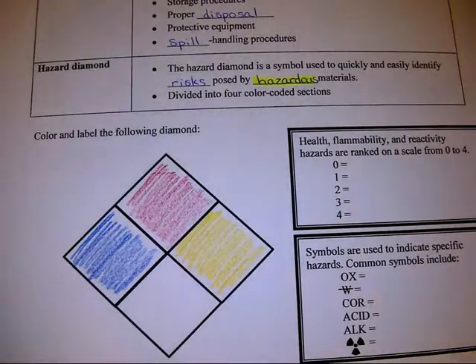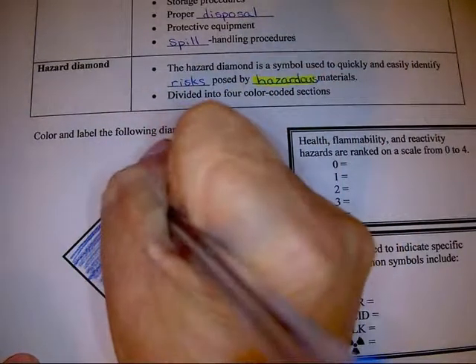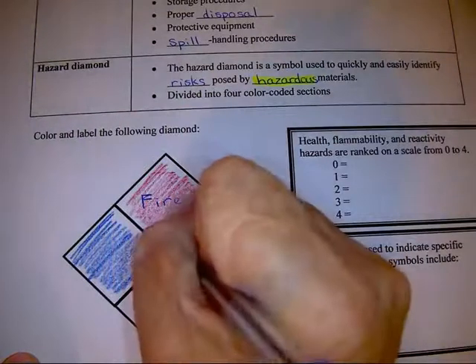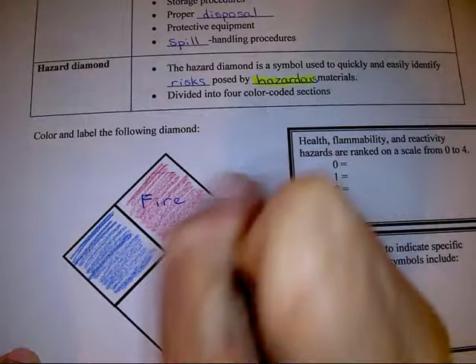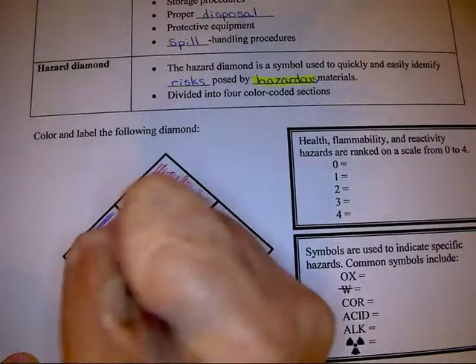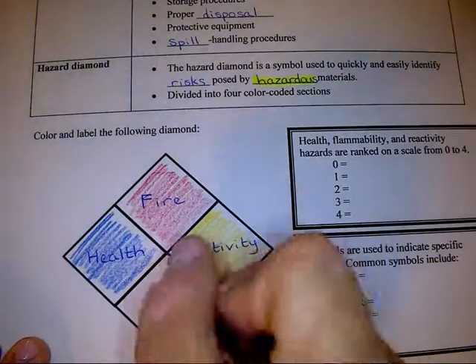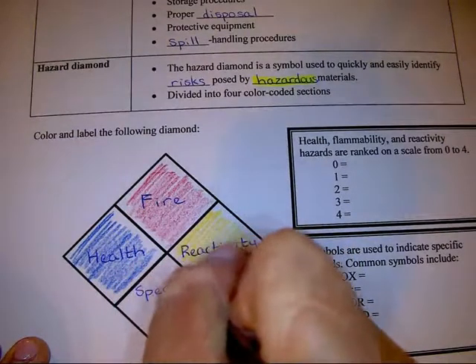Each of these colors stands for something. The red stands for fire. Yellow stands for reactivity. And the blue stands for health. Now, this white section is for specific hazards.